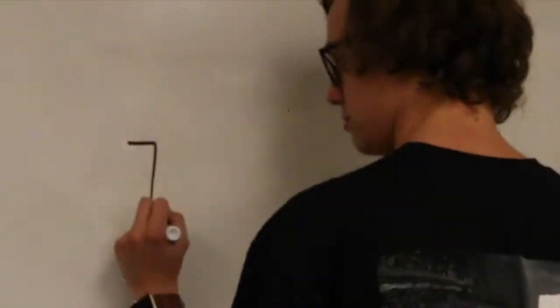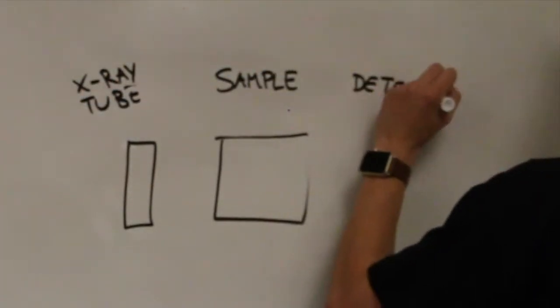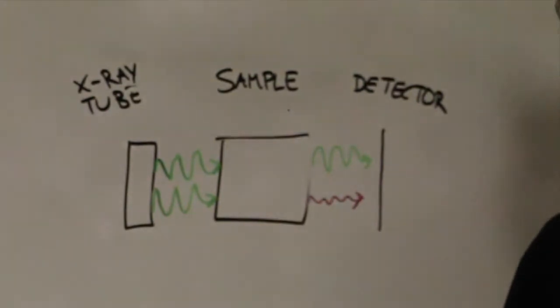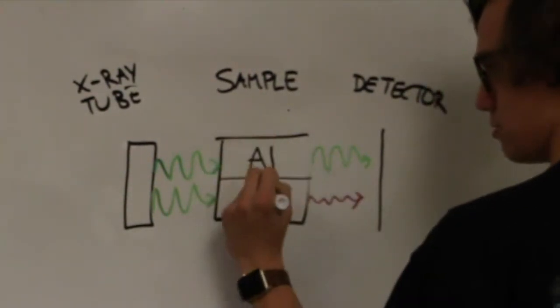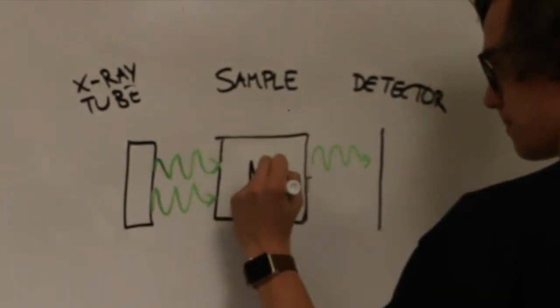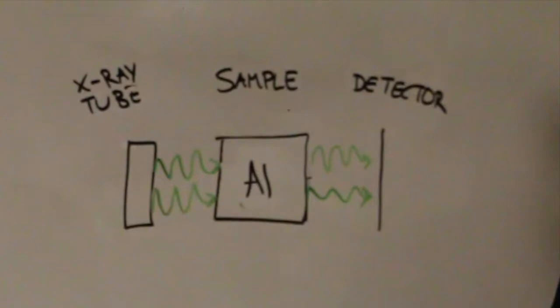opposite side. To create an image with contrast, the material must interact with the X-rays in certain ways. Firstly, the material must partially absorb some X-ray photons, while allowing others to be transmitted directly to the detector. Secondly, the material must also allow for differential absorption, meaning different materials in the sample must have different X-ray absorbency characteristics. Without this varying degree of absorptivity, a pure sample would yield a solid gray image.